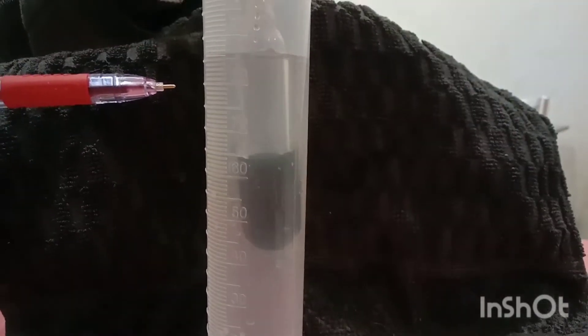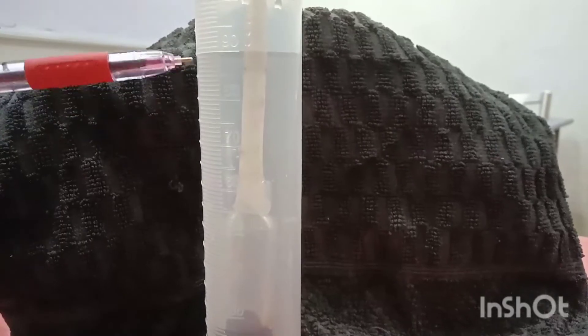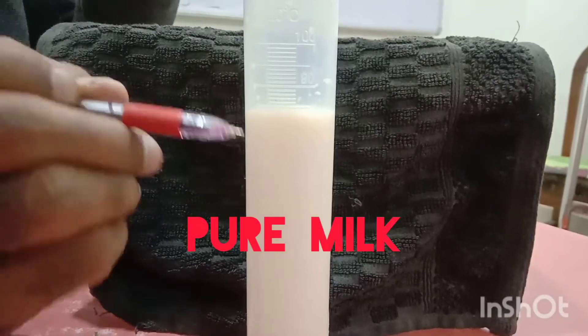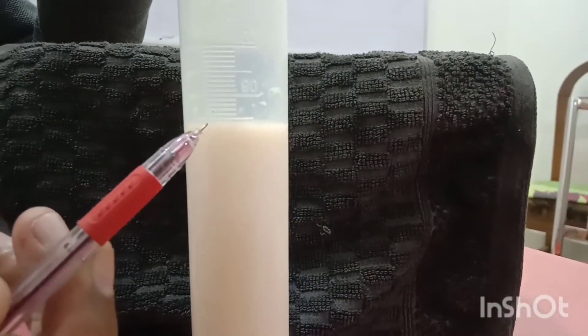Some amount of water is taken in the measuring cylinder and the water level is noted — it is 75 cc. Now the lactometer is immersed in it and the water level rises to 90 cc. Now milk is in this measuring cylinder — you can see the reading is 84 cc.